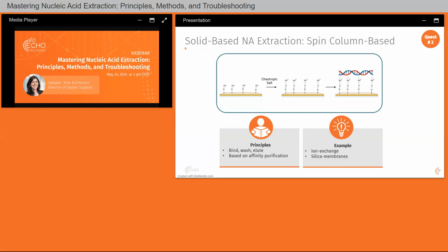And this is just because of different charges, which means it's kind of a stable bridge, but you saw we apply salt, this bridge built up. If we reduce the salt content, the bridge will kind of get broken down again, and then we can rescue our DNA. So this is really what happens during this method.